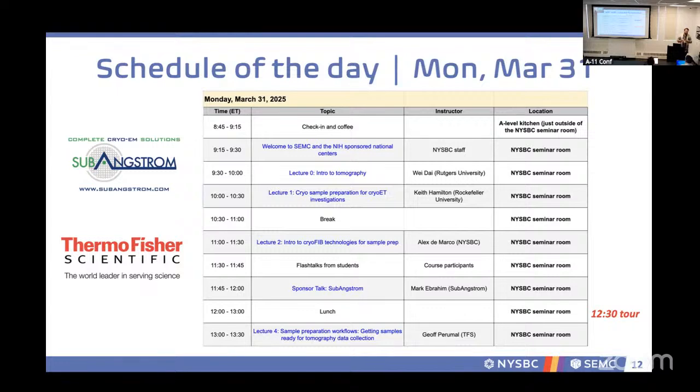And there are other things. People are talking about the Vitrojet, which may or may not work to freeze things. Some people claim it can freeze very thick samples. You just basically shoot propane at both sides. But that's very expensive, so it's not accessible to most of the users, right? Yeah, and also I don't know if it really does work.